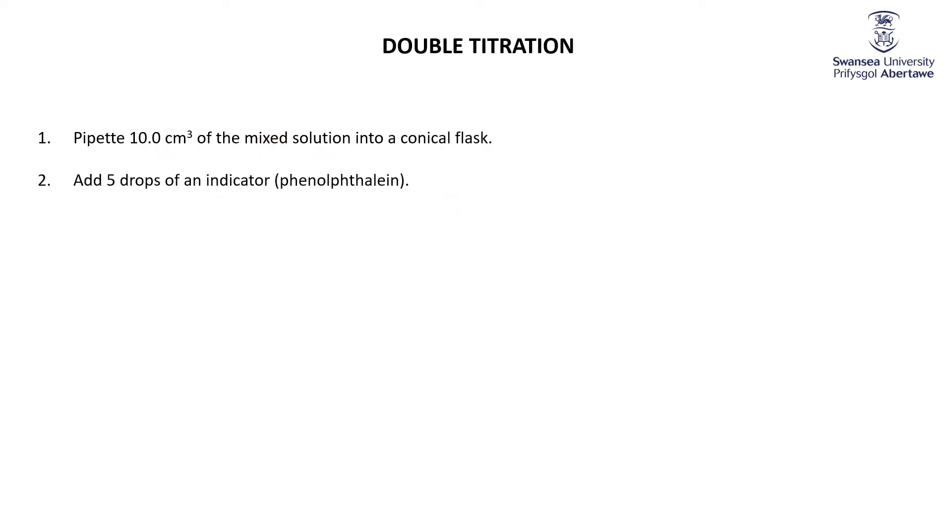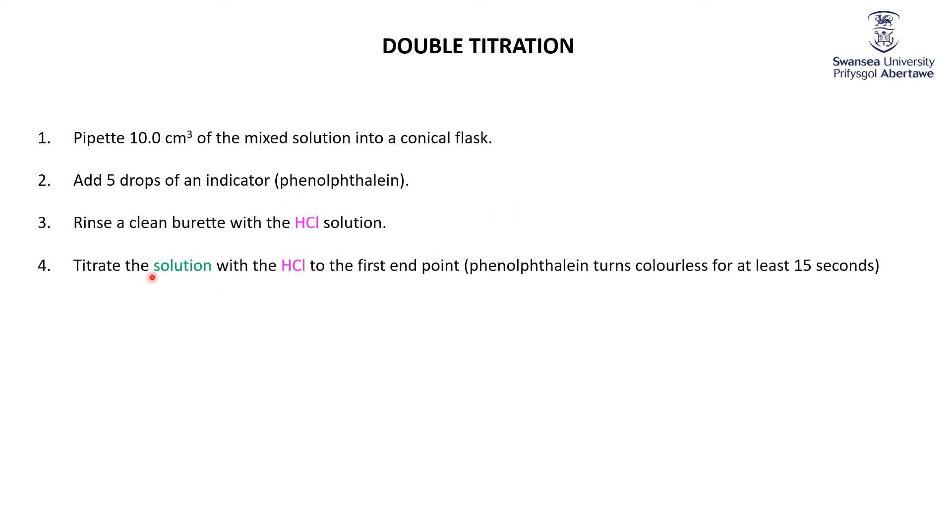Let's go through the rather simple experimental procedure fairly quickly. First of all, we're going to take 10 cubic centimeters of my mixed solution, put it in a conical flask, and add the phenolphthalein. Then we're going to titrate the solution with HCl to the first endpoint — that's where the phenolphthalein goes from pink to colorless.